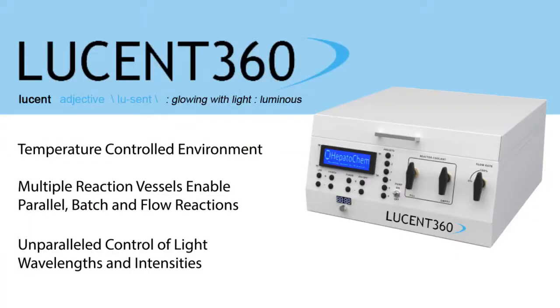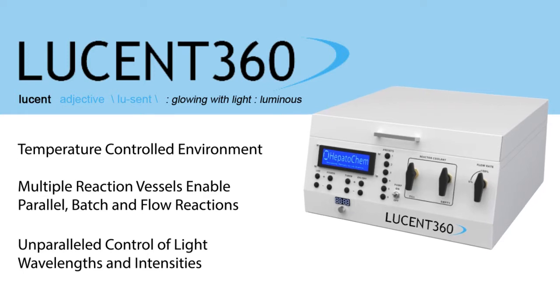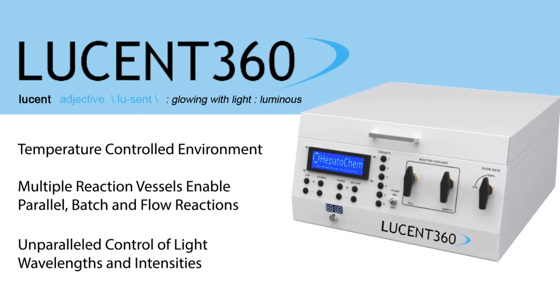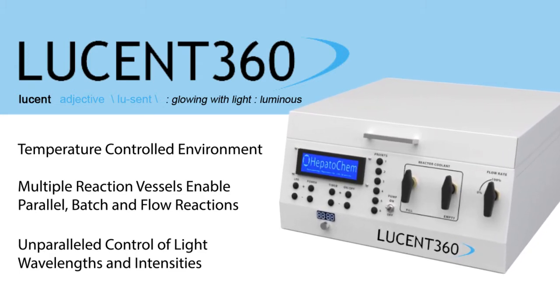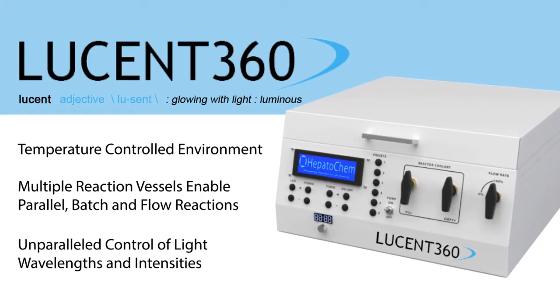Let's highlight a few of the Lucent 360's key features. Its temperature-controlled environment comes with a built-in reservoir and heat exchanger. We offer a variety of reaction vessels that enables you to easily perform parallel batch or flow photochemistry, and our proprietary design provides unparalleled control of both your light's intensity and wavelength.